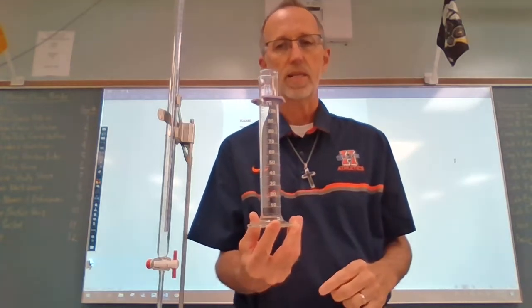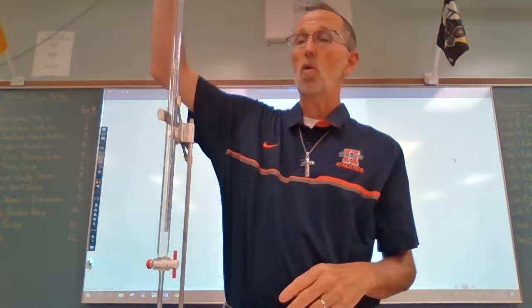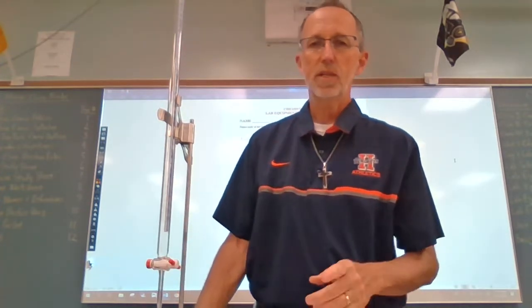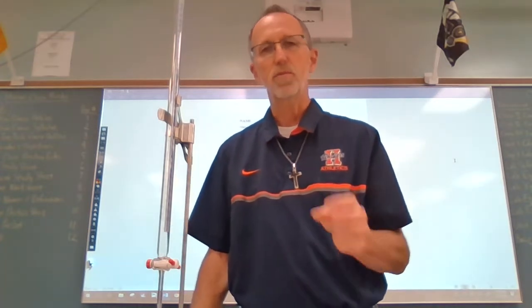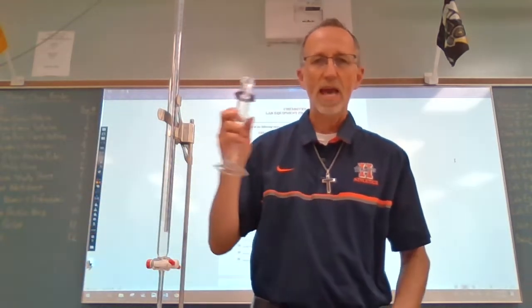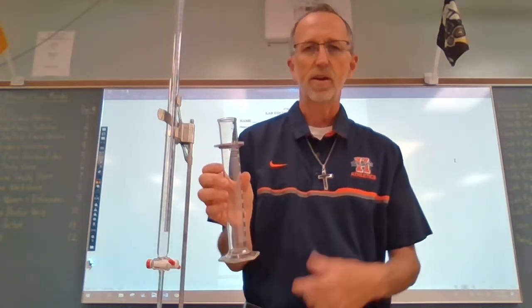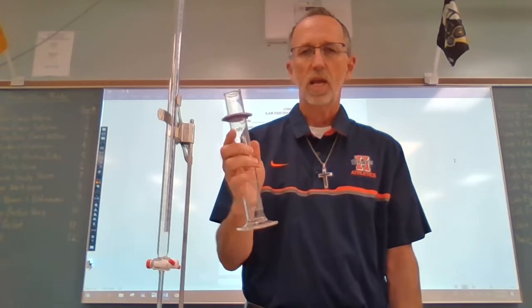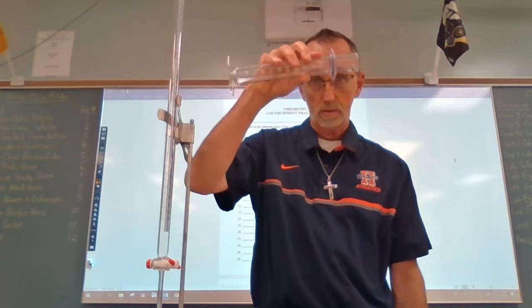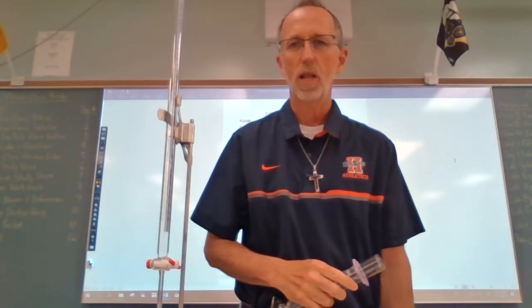This is a 100 ml graduated cylinder. A burette, you pour liquid in from the top, but you release it from the bottom. When you want to release a specific volume of liquid, which is what you use a burette for, this is what you want to use. Now, if you had this full and I say, okay, pour 10 mLs out of this graduated cylinder into another container, a beaker or whatever, and you try doing that, you start at 100, you want to go to 90, and it's like, no, too much. Doesn't work well at all.